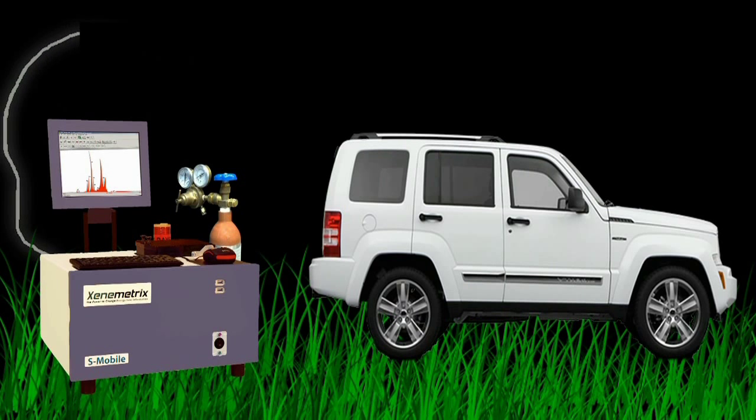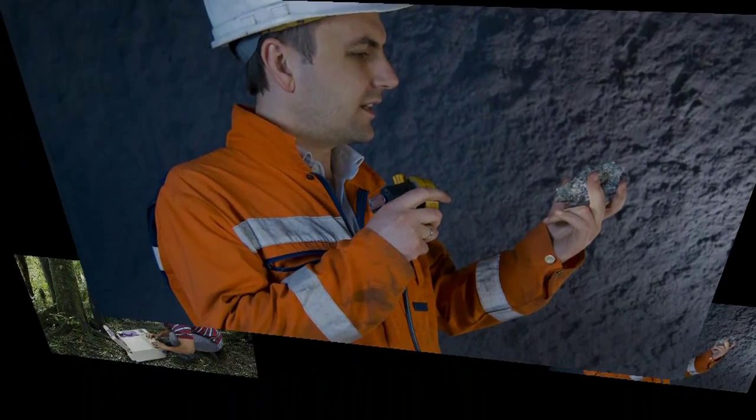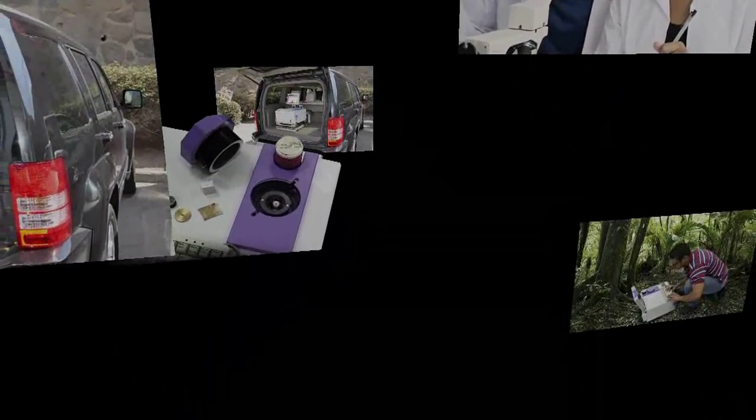Mobile laboratory working mode with car power inverter and shock-absorbing system. All of these give S-Mobile the ability to analyze very complicated materials in a variety of matrices while working in the field.